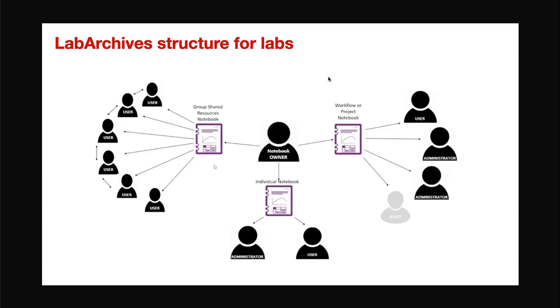So the structure is very flexible because it's very easy to invite, it's very easy to create multiple notebooks per person, and it's very easy to add people as users. So this is up to your lab. And again, if you think it's useful, I can come to your lab meeting and we can discuss this a little bit in advance.